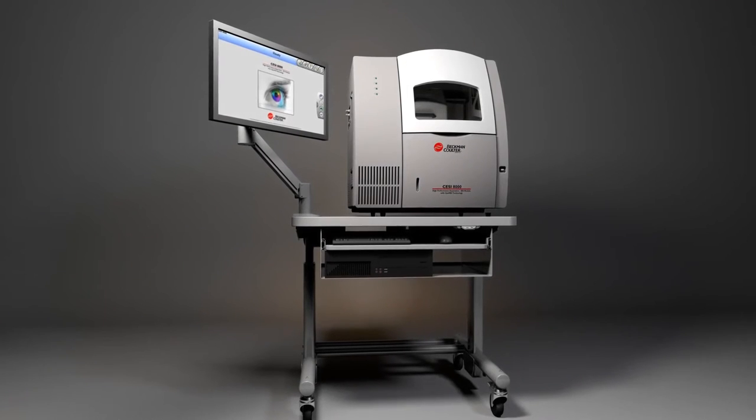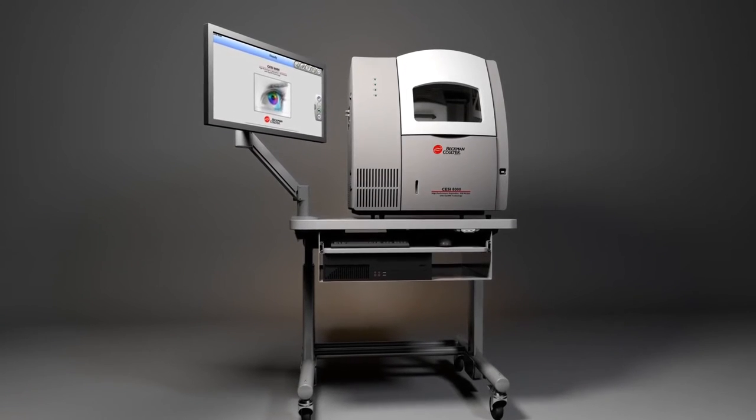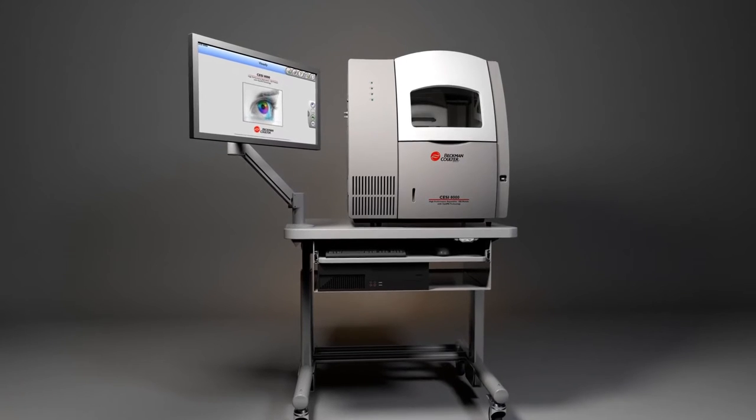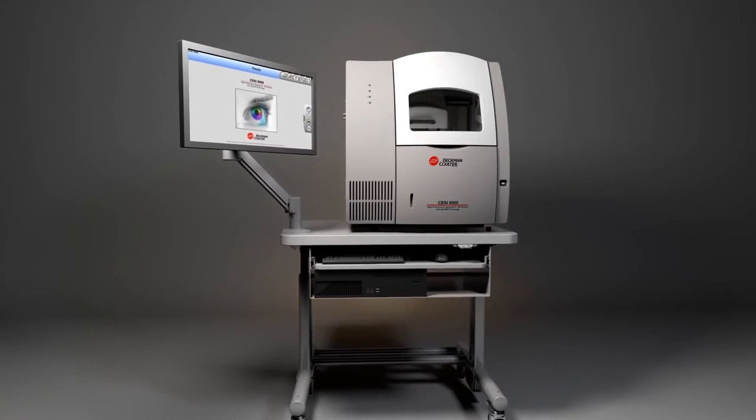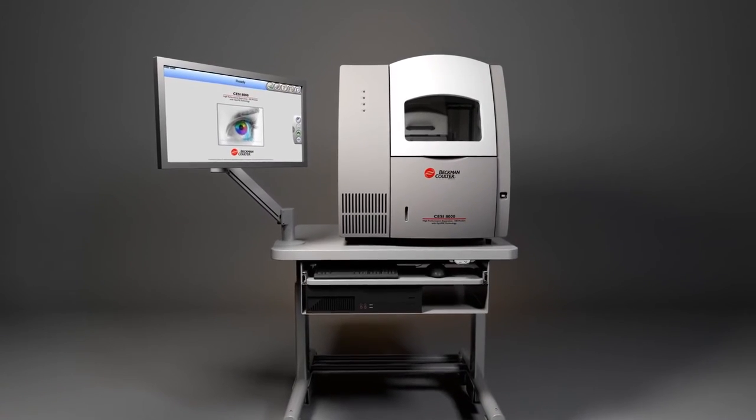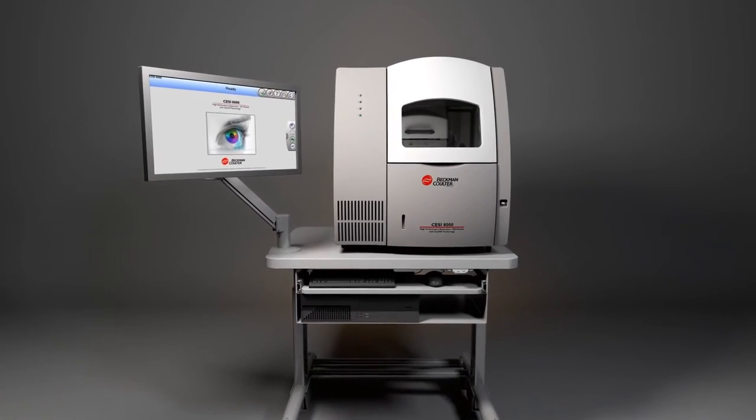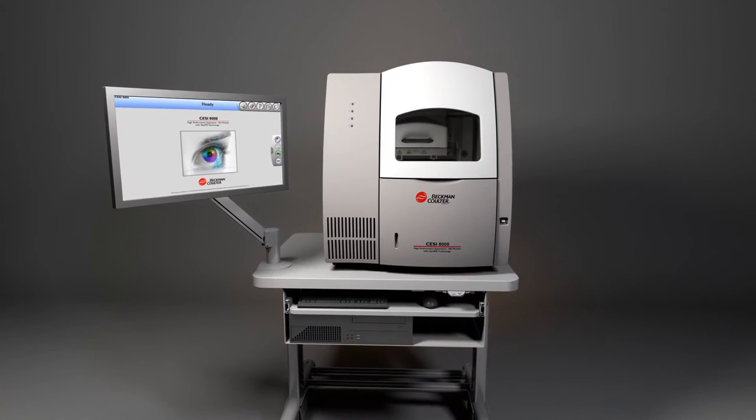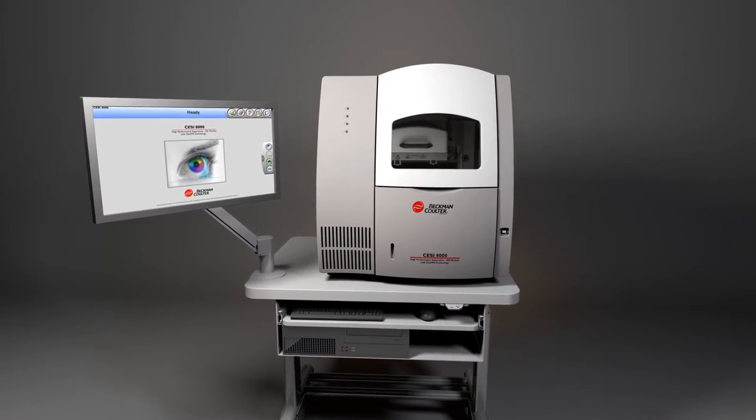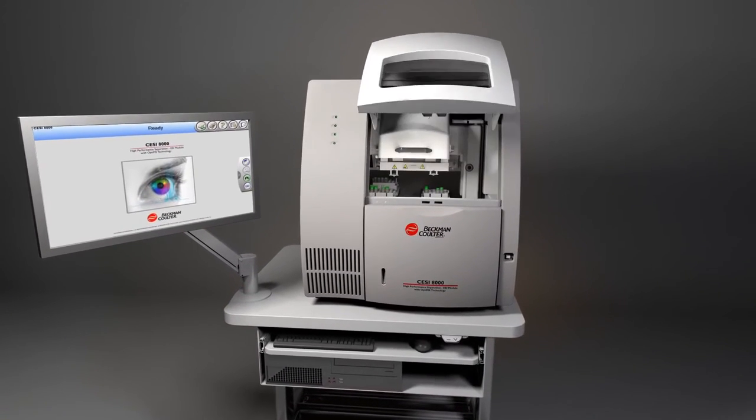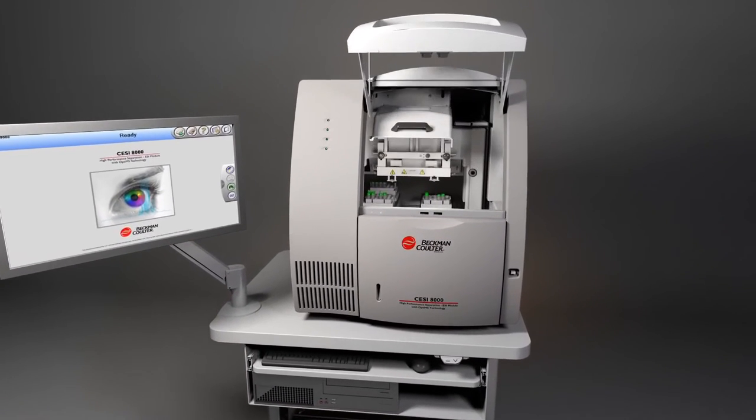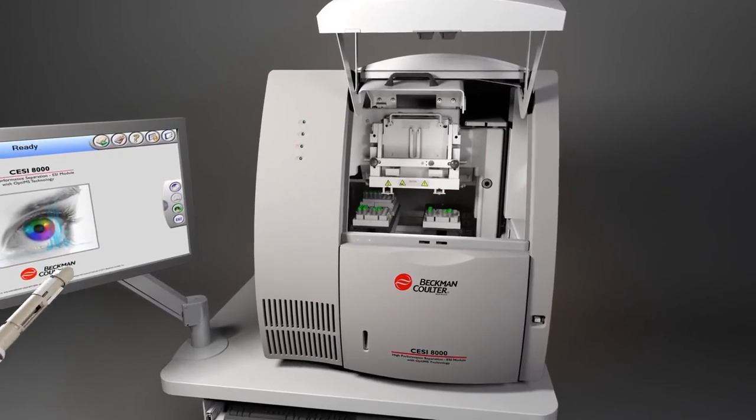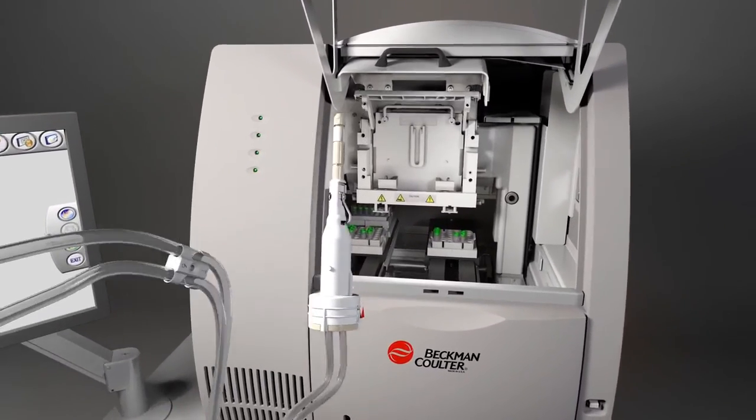CESI seamlessly couples CE and electrospray processes within the same device, enabling your laboratory to realize mass spectrometry performance without compromise. Your scientists can now concentrate on the biology rather than the technology.